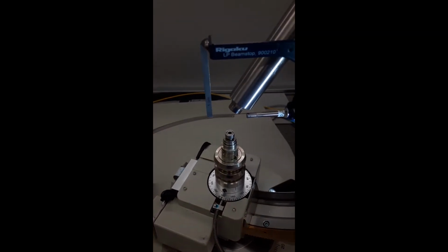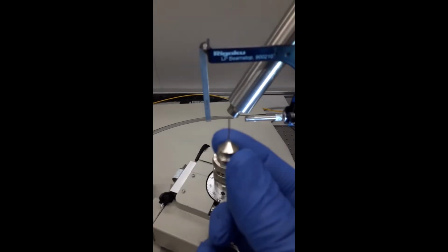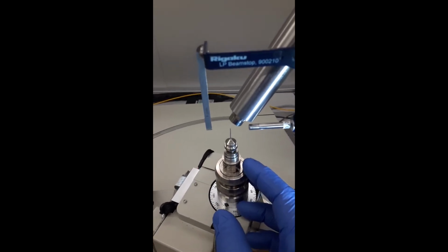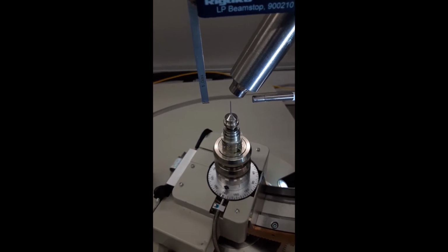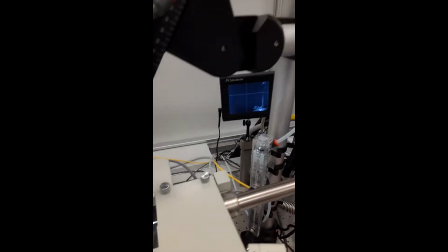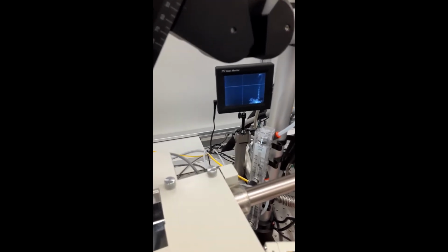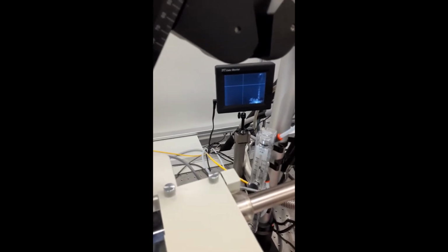So when we put a sample on, the sample is going to be in one of these small loops that are magnetic base. The magnetic base will fit on here like so. What we want to do next is make sure that sample is centered in the beam and the cryo stream. If we look up here at our sample monitor, there's a camera here that points at the sample, and the image is shown on the monitor there. So what we'll do is center the sample on those crosshairs. Now I know that crosshairs are where the center should be because that's calibrated ahead of time.